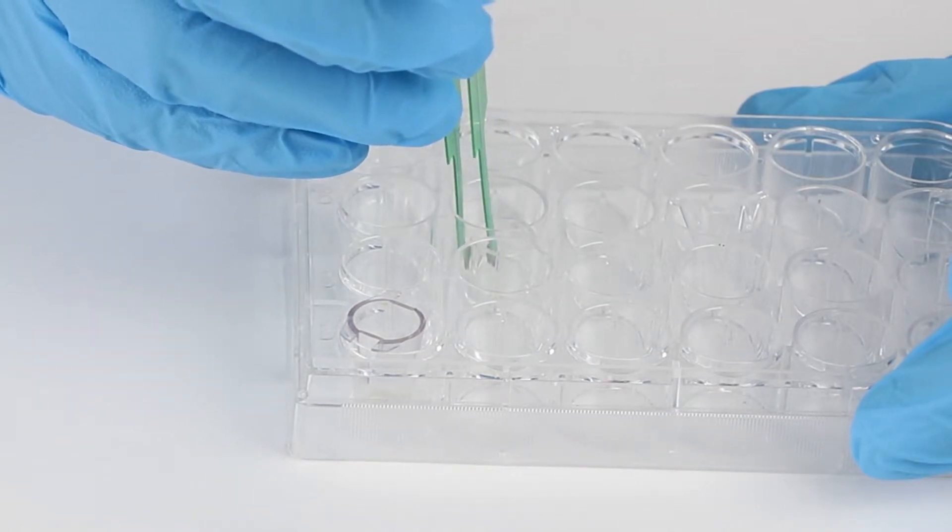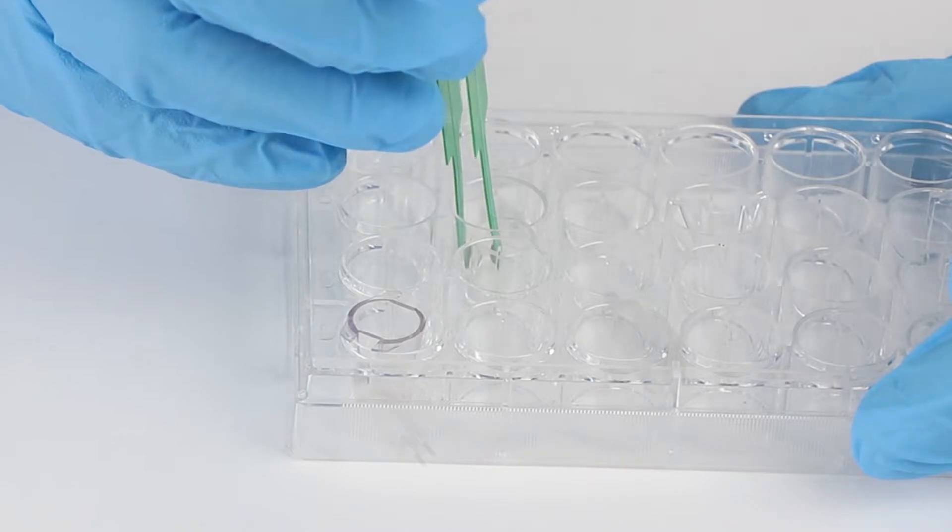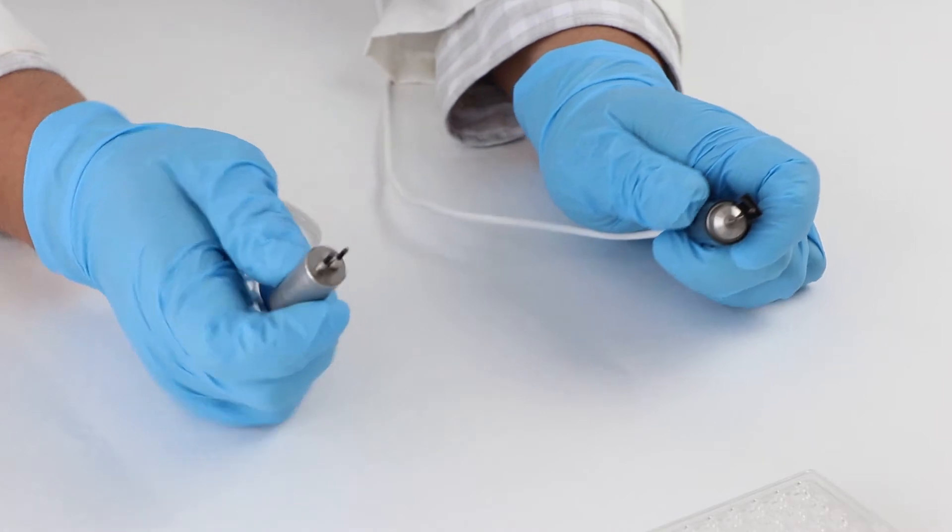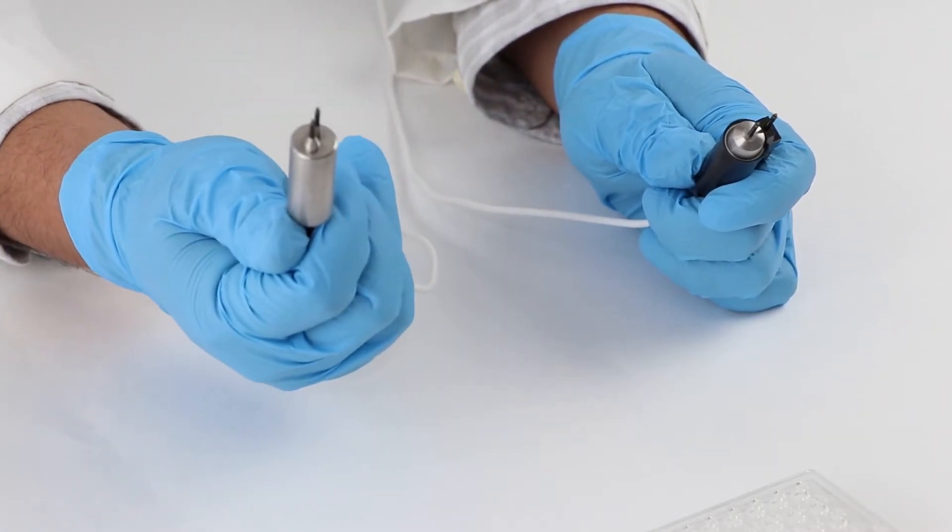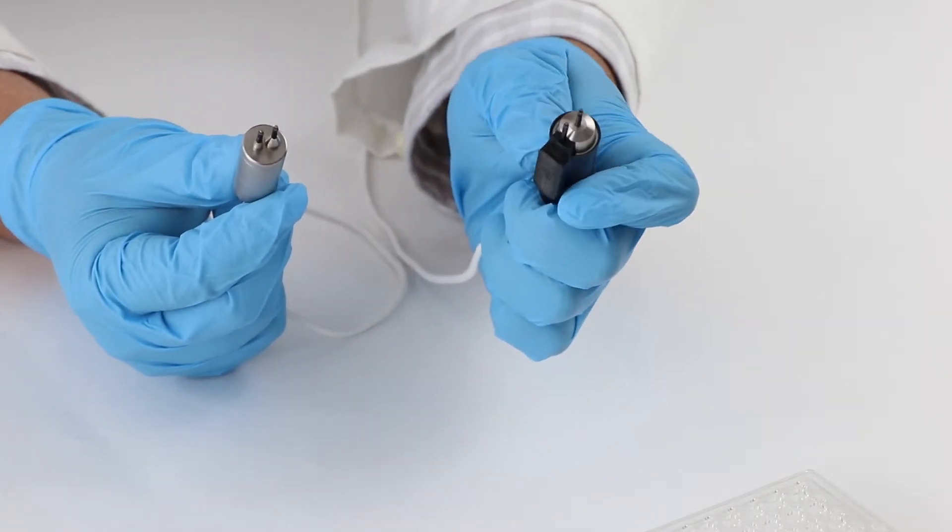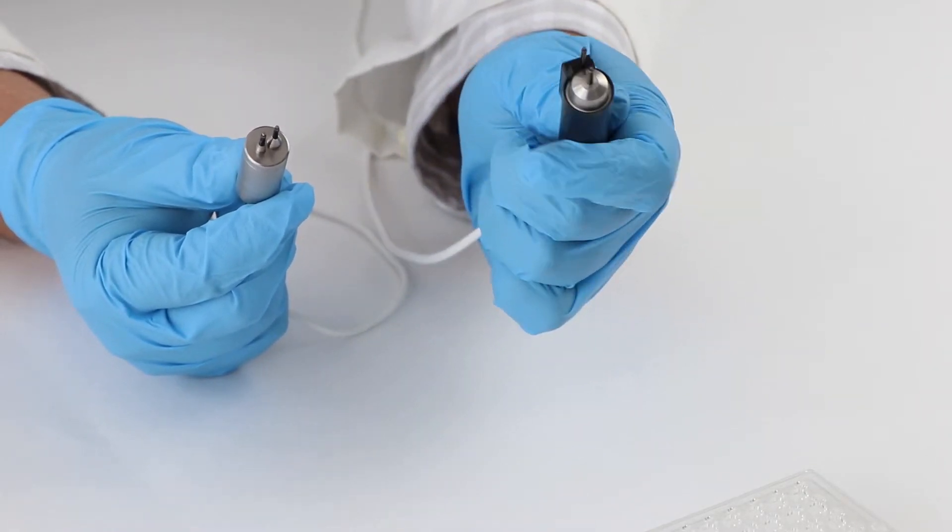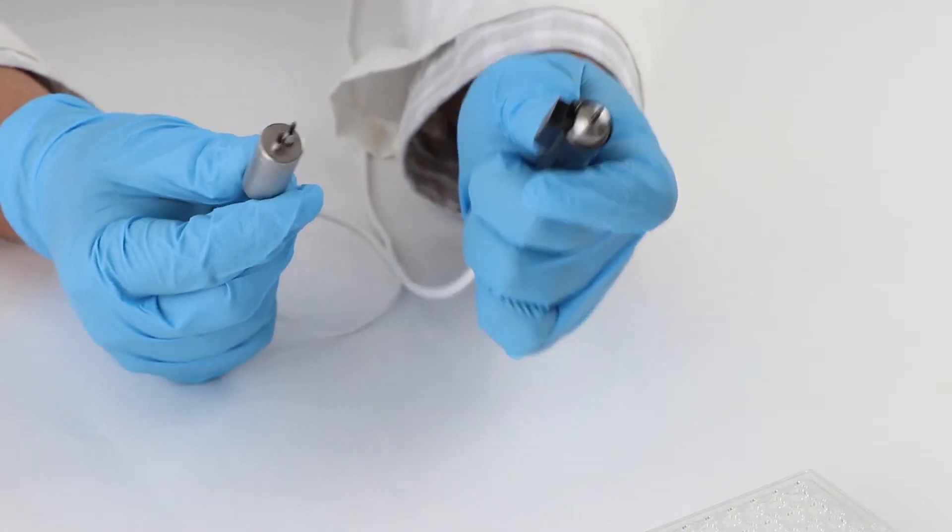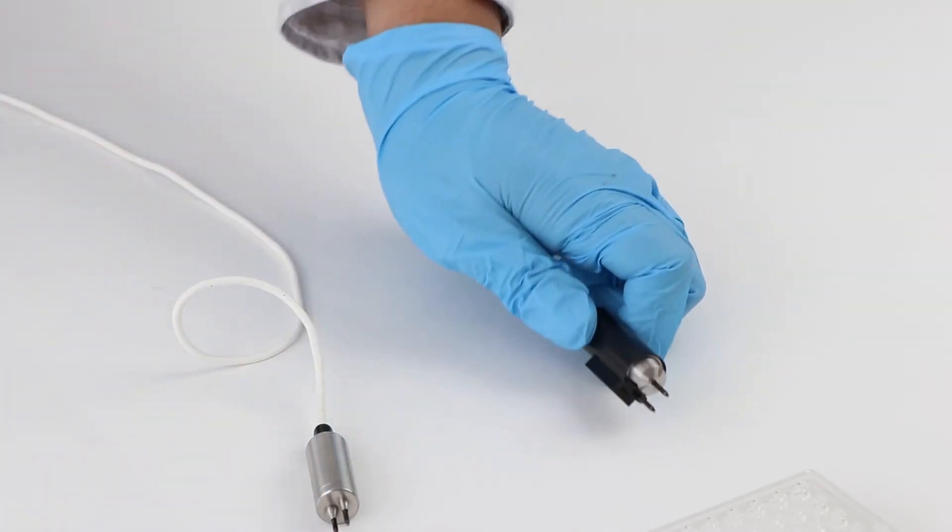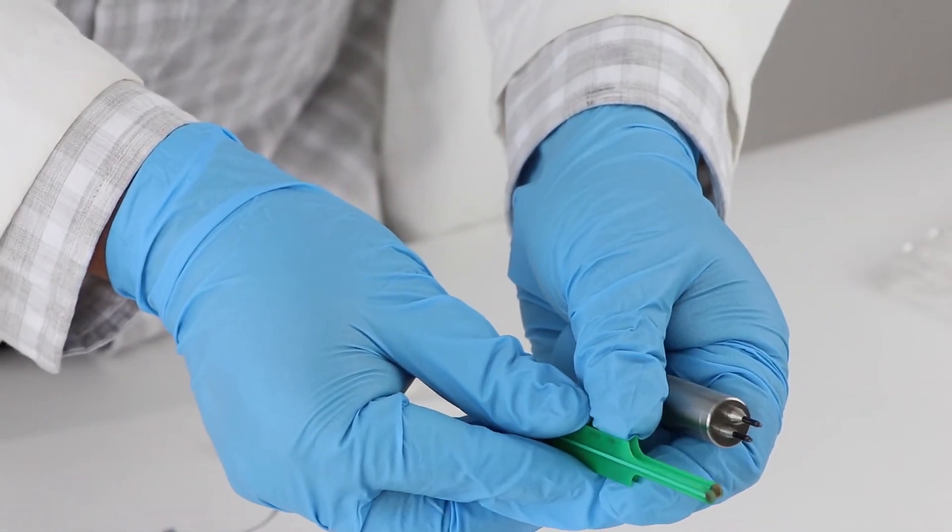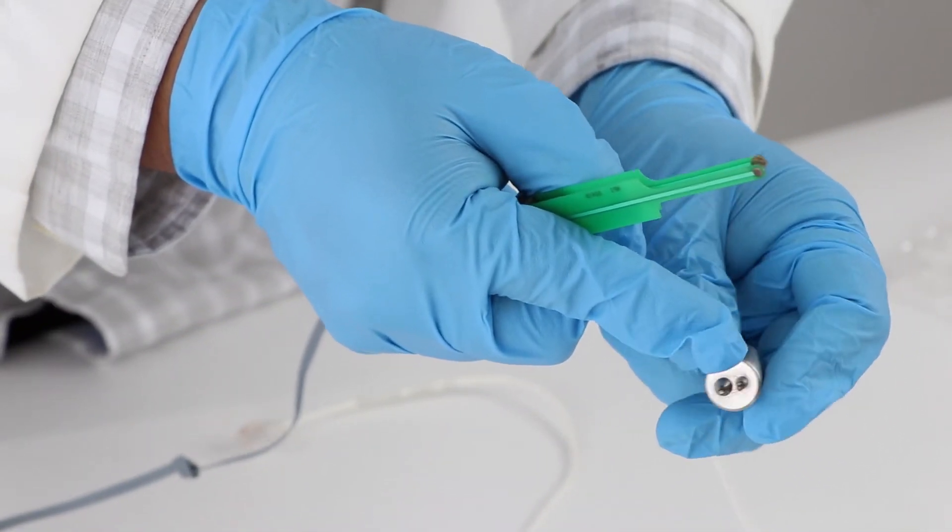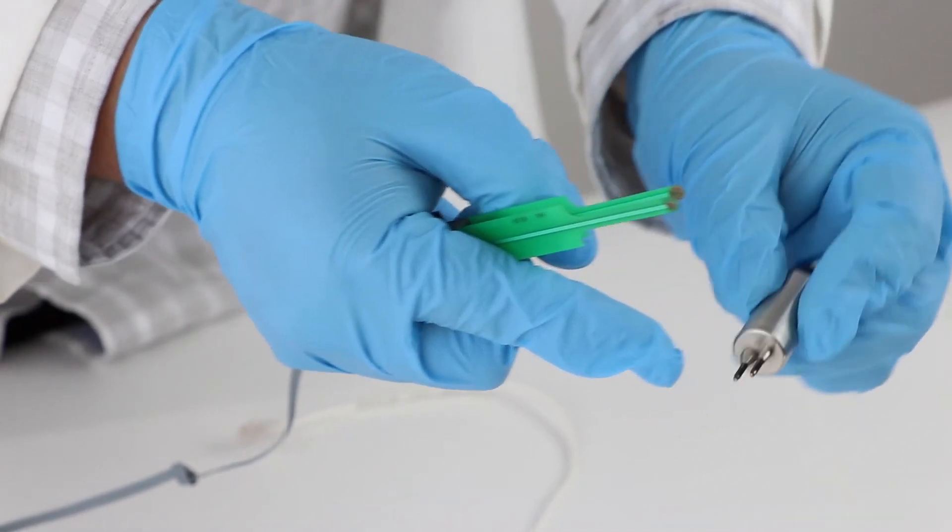The STX100 electrodes offer higher precision since they sit stably in a well plate. You do not need to keep holding the electrode during measurement. The upper part of the STX100 is made of solid metallic component so that it is rigid.